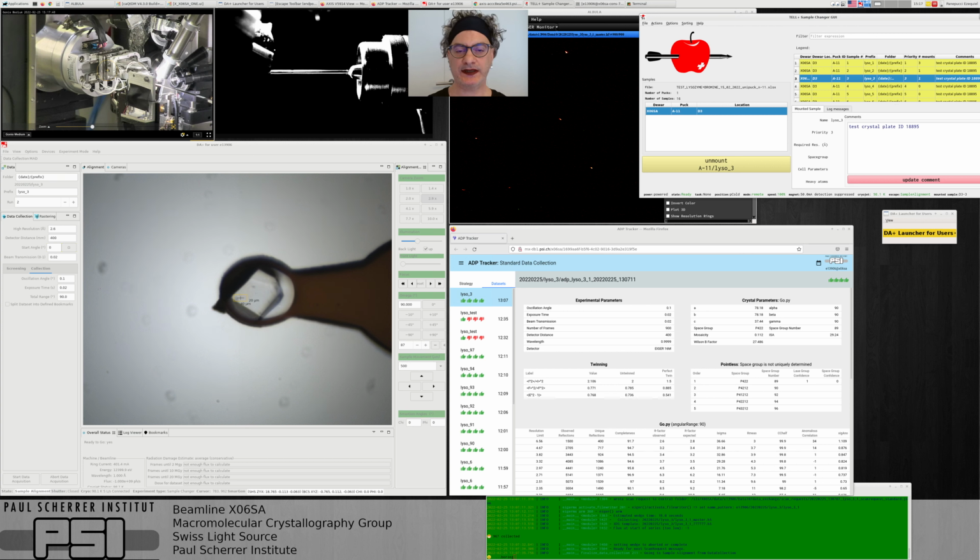Hello everyone, I'm Zach. I work at the Macromolecular Crystallography beamlines at this light source, and I'm here to make a demonstration of the SmarGon that was recently installed at our beamline X06SA.